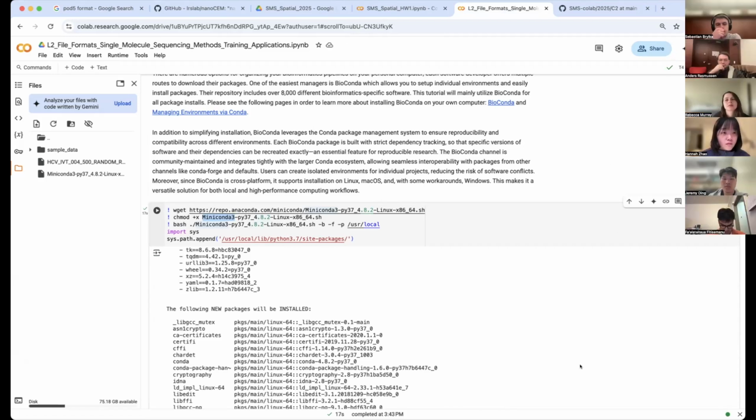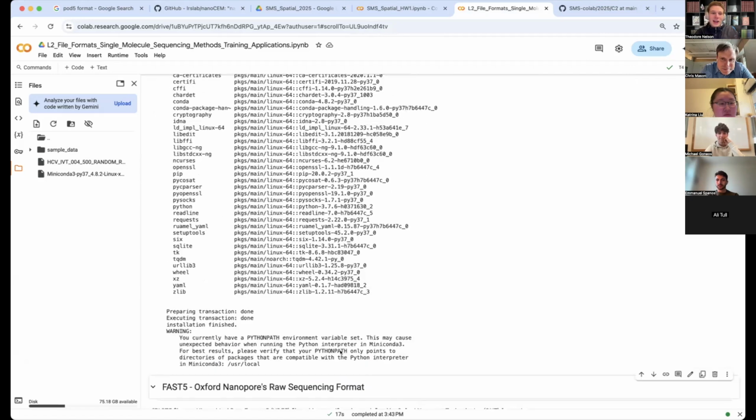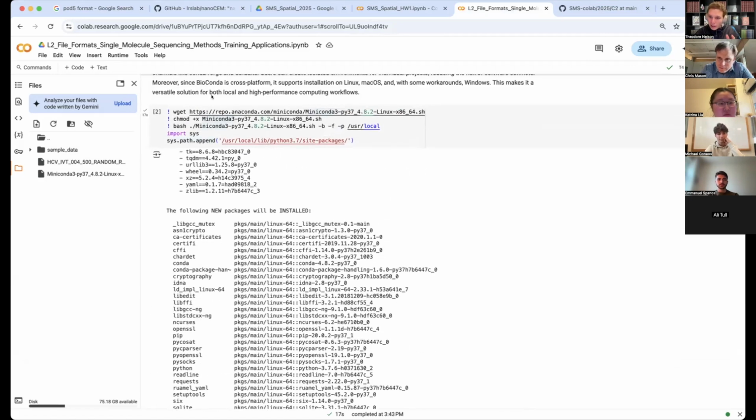Is anyone familiar with why BioConda is so important for package management in particular? What I am getting at is that if you have something like SAMtools, and another program Y, and they both require pandas because they both like working with data frames, these spreadsheet-like data formats, and they both access different commands available in pandas, you might think, I'm just going to install pandas, install SAMtools, install package Y, happy days, right? But let's say those two packages were developed at different times, and as a result, they require different versions of pandas.